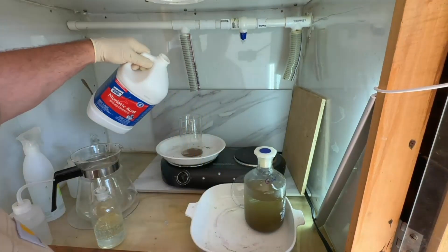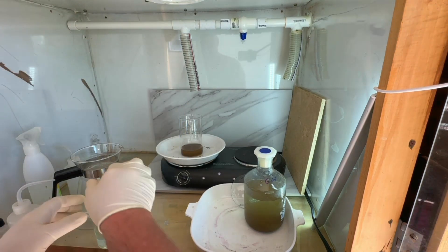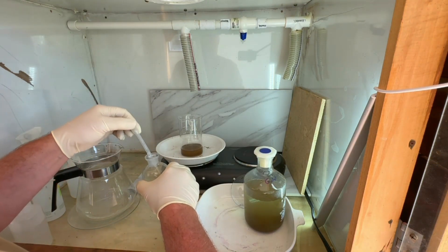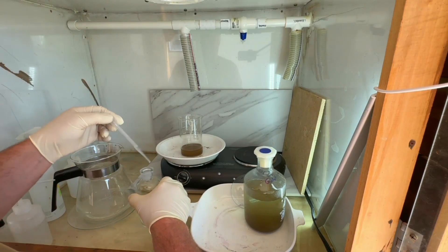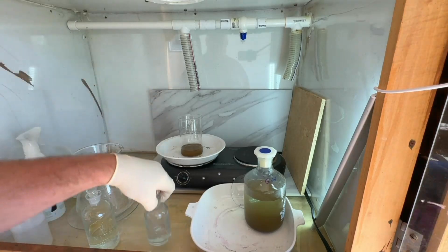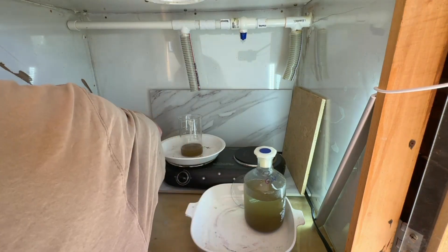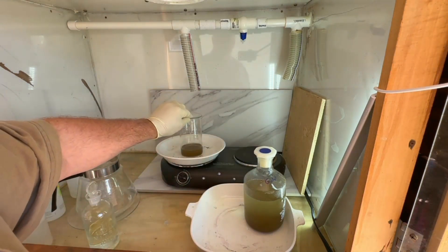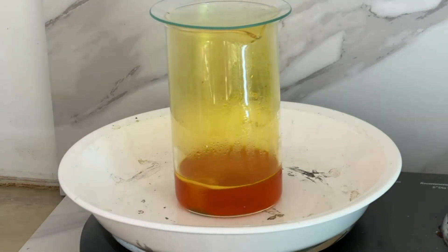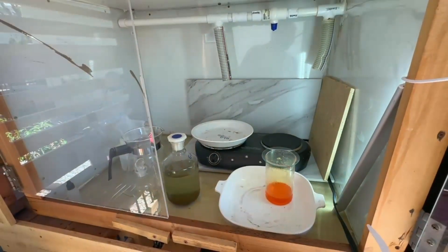For our second refine we're going to start with about 150 milliliters of hydrochloric acid. There's not a lot of gold powder, so we're going to use six milliliters of nitric acid. To drop any residual lead, we'll shoot a little bit of sulfuric acid into our aqua regia. We'll put our cover on and turn up the heat just a little bit. You can see that powder start to absorb and get that beautiful orange-red color as the gold goes back into solution.